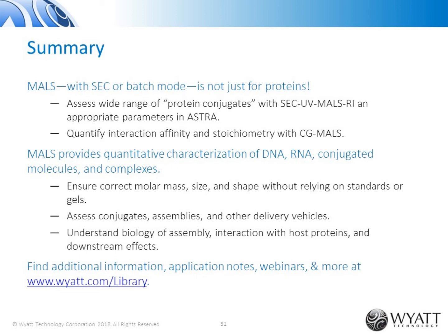And over that time, what we saw in the light scattering signal is that at early times, the signal would increase, and then eventually it would saturate, and that it saturates as we approach equilibrium. And at that point, you could keep waiting, but the concentration of the products and reactants is where it's going to stay for that equilibrium.